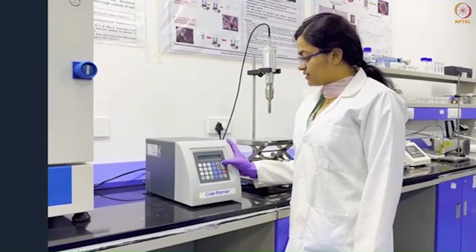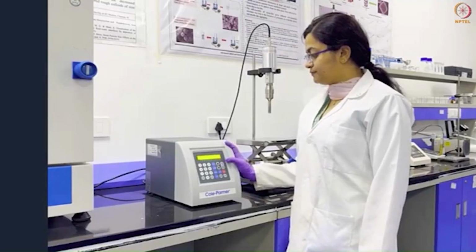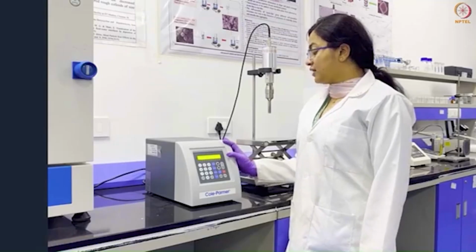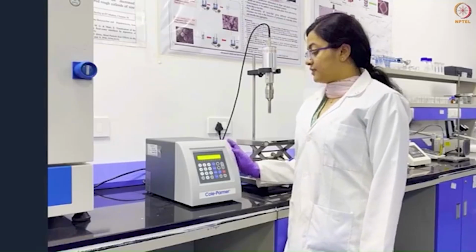Now we'll switch on this equipment, the probe sonicator. As you can see, it uses 750 watts and 20 kilohertz of high frequency.